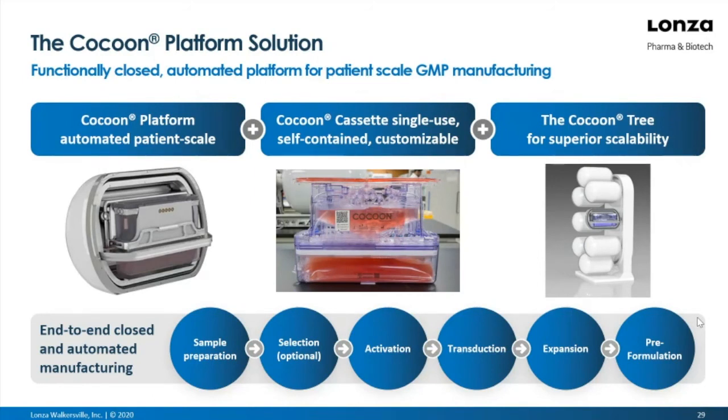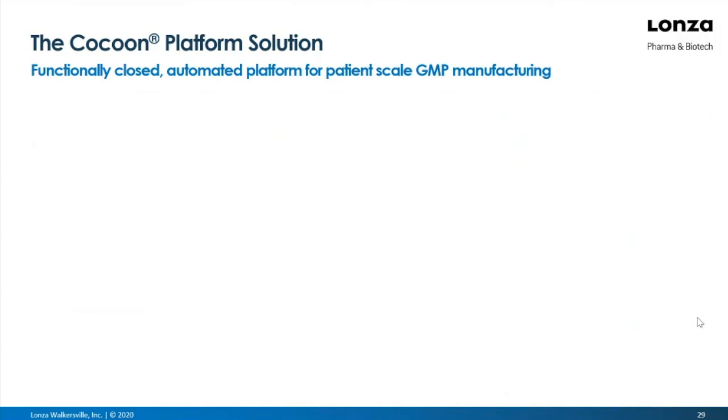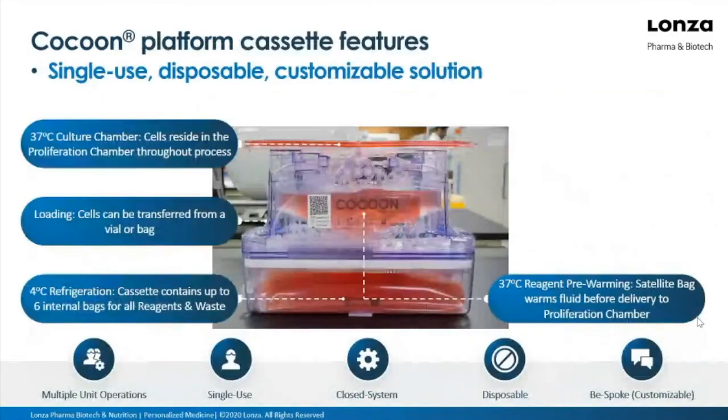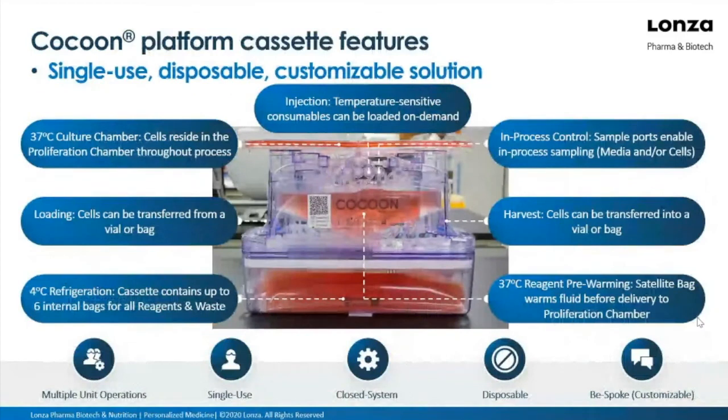Good question. Do we have any more questions? This is a very interesting area. I believe the Malaysia landscape in CGT is also moving very fast, and the regulation keeps changing, so do keep yourself updated on the regulation needs. The Lonza perspective might be slightly different from yours. For example, can I have the cocoon inside my class C room, or should I have my cocoon in my class B room? That is something we have to work out with the local regulation. But when the time is mature enough, we are able to have a discussion with you and the local regulator.